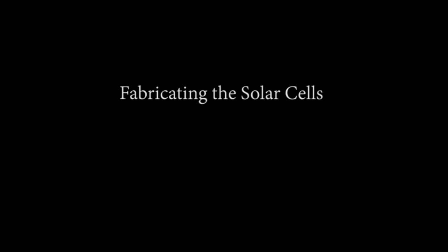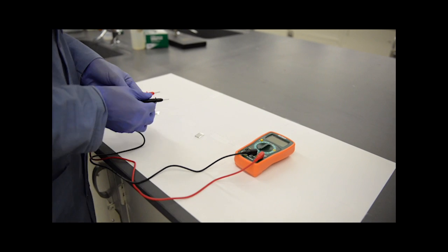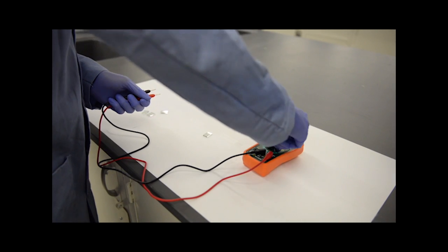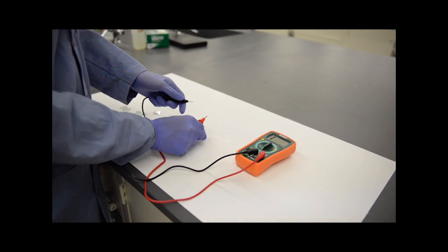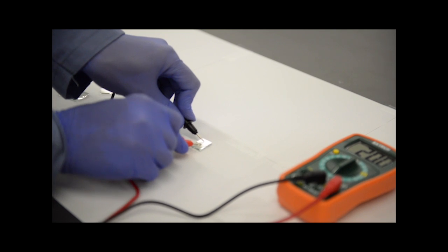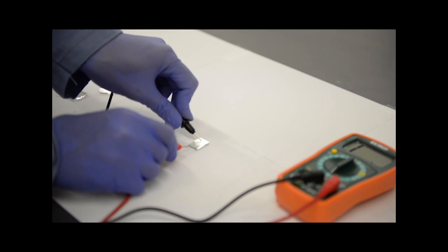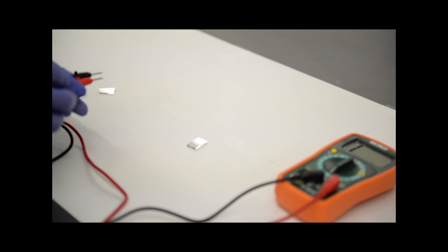In the first step, we will determine the conductive side of FTO glass. To determine the conductive side, we set the multimeter to resistance mode, plug the two leads into the multimeter, and measure the sheet resistance on each side using the probes. The uncoated side will not give any value.